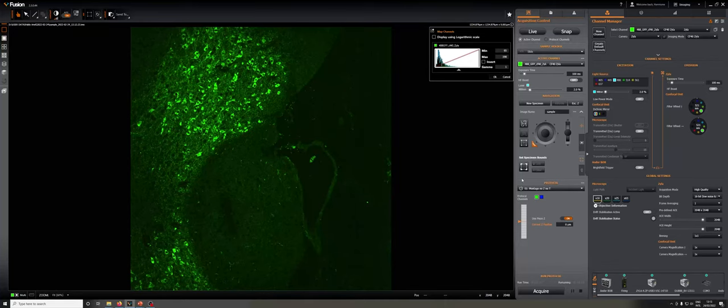Let's talk about the most basic adjustments one can make to an image, which are through adjusting the exposure, which can be done here, and the laser power, which can be done here.